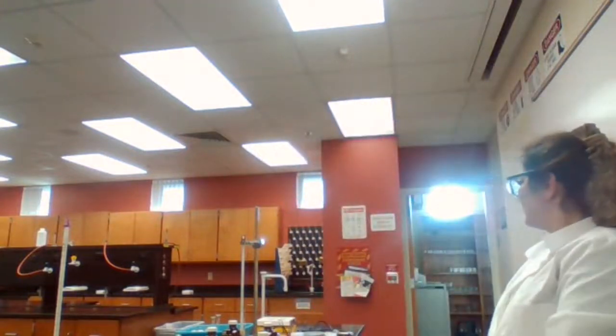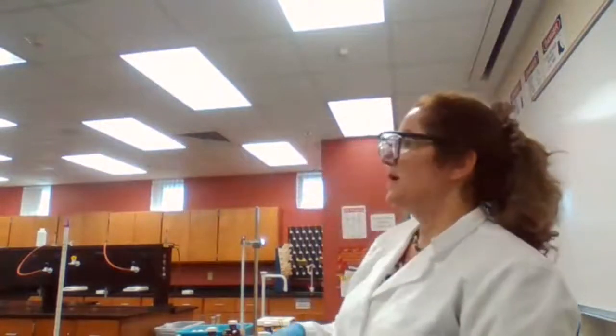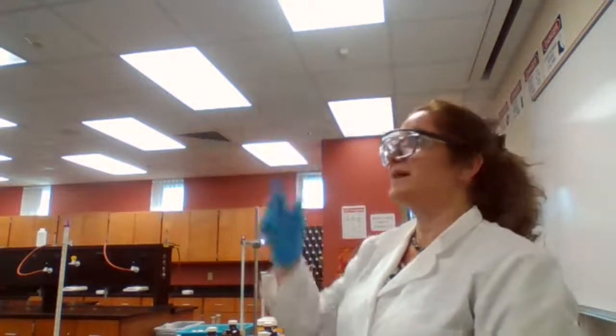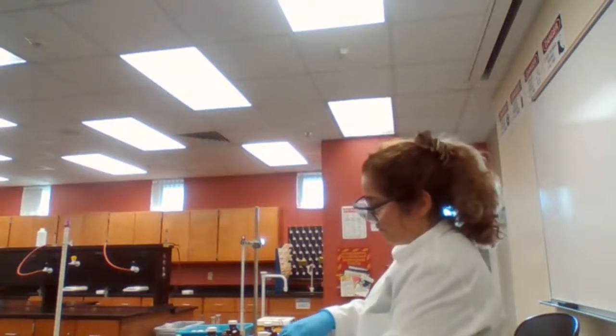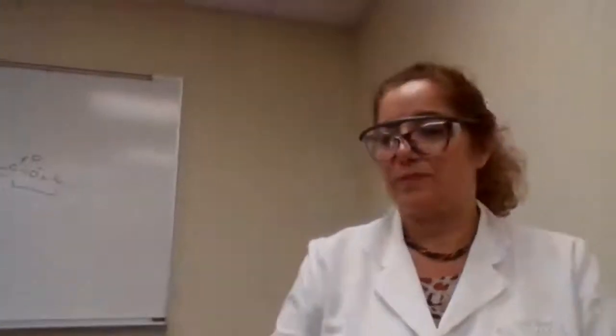I don't really do this experiment when I have the students here. Just say we have combustion reaction. If it generates enough heat and smoke, it can activate the fire alarm. But if I take it to a fume hood and I try it with a small sample of the alcohol, it might work. Okay. I'm going to take it to the fume hood and show it to you there. It's just showing that organic compounds are combustible also. Thank you so much. So, this is the combustion reaction of the organic compounds.